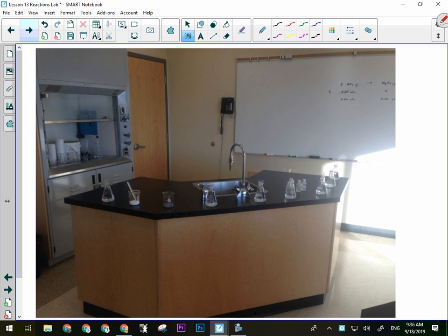Look at the bulb. If the stuff has come off, throw it away. If you can't remember where you got it and the label came off the bulb, it's probably on your finger. If it comes off the bulb, just throw the eyedropper away. They're cheap, they're disposable. It's way better to throw one of those away than it is to contaminate the solution. Right? So that's what happened.